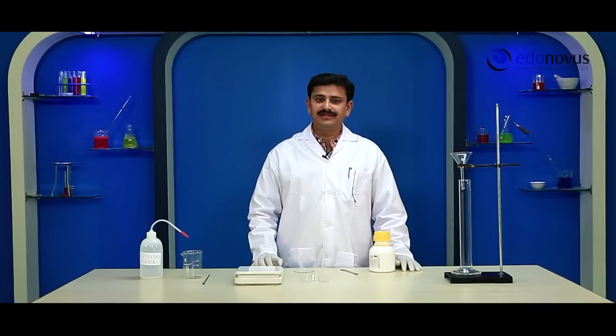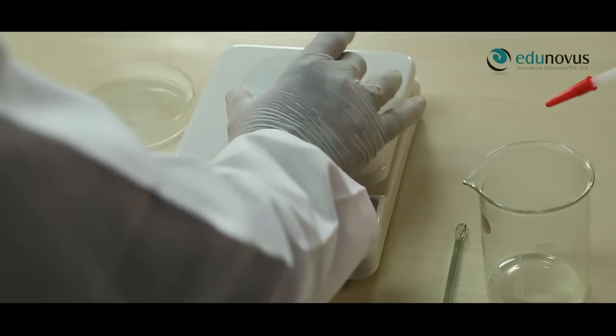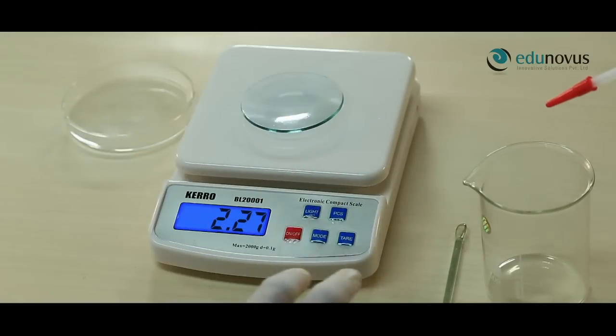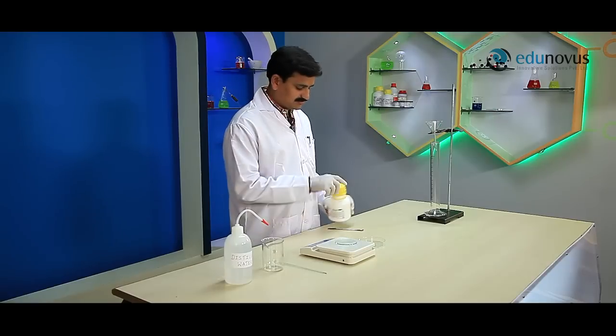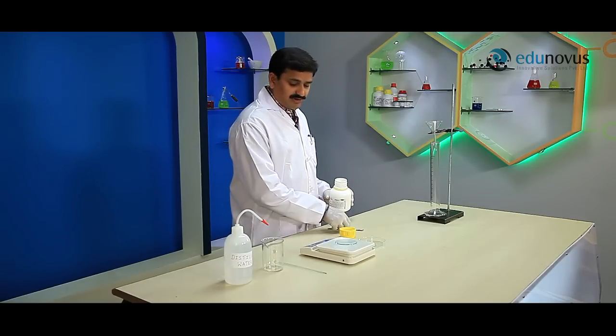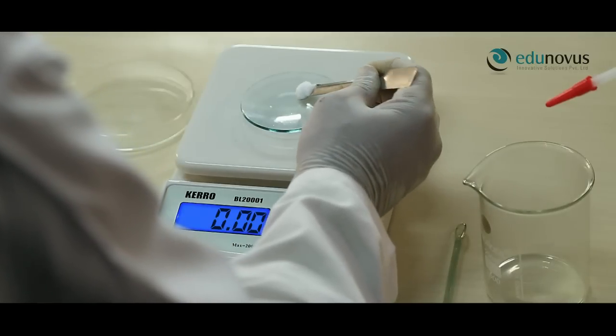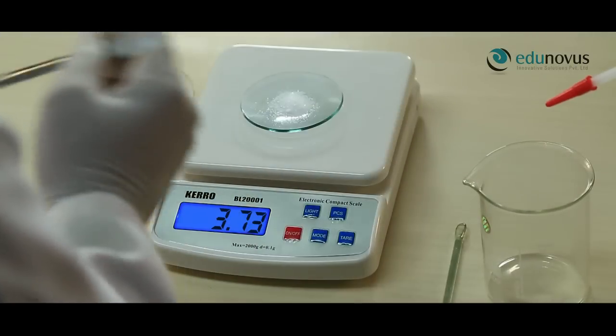Take a clean and dry watch glass. Now we place it on the weighing machine and zero its reading. After that, weigh 3.150 grams of crystalline oxalic acid on the watch glass.